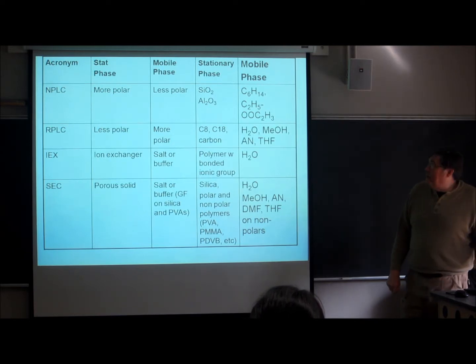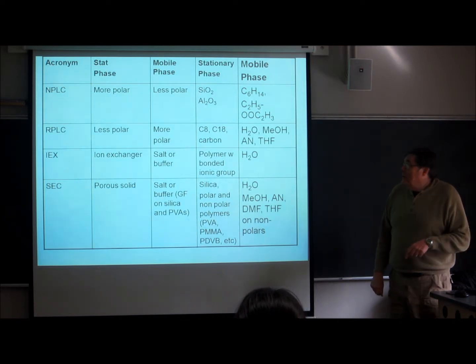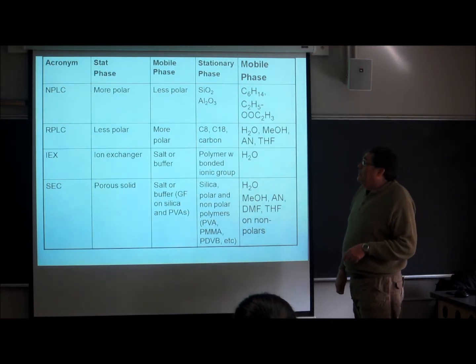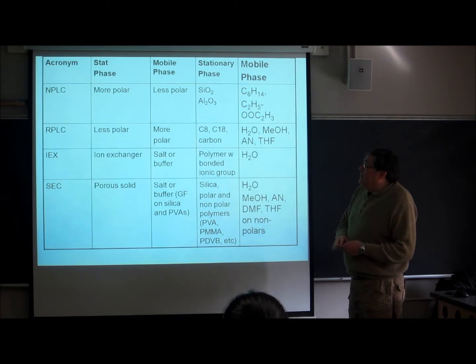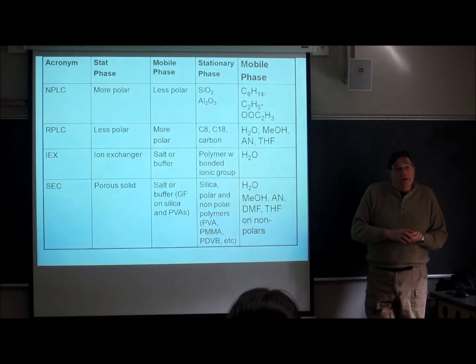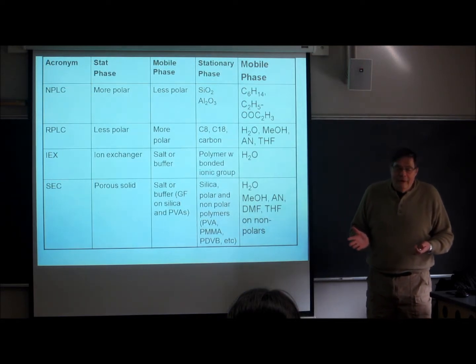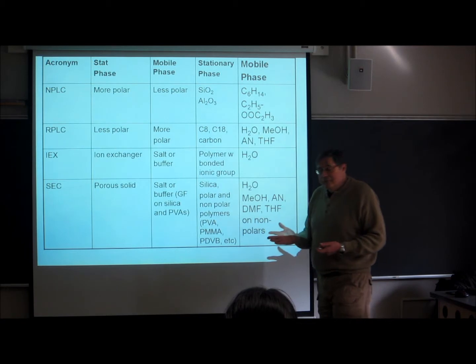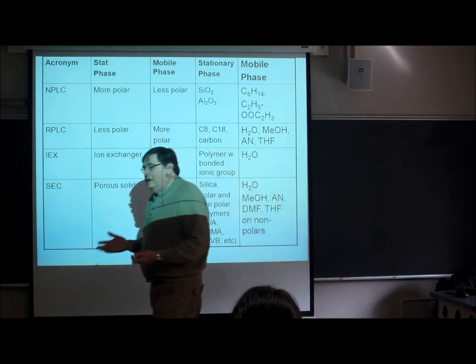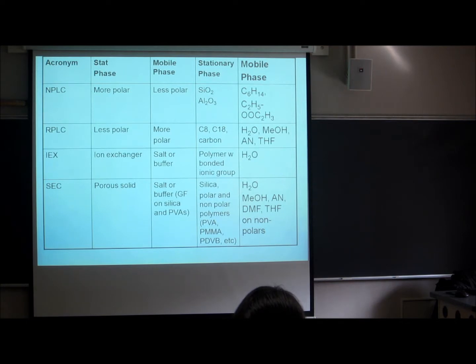All right, now I'm not going to belabor this. It will be on the web. I'm going to give that to him to put on. But I do want to point out one of the advantages that HPLC has over gas chromatography. And that sounds odd and out of left field. In gas chromatography, the separating ability of a column really depends on the nature of the column material, but not of the mobile phase.